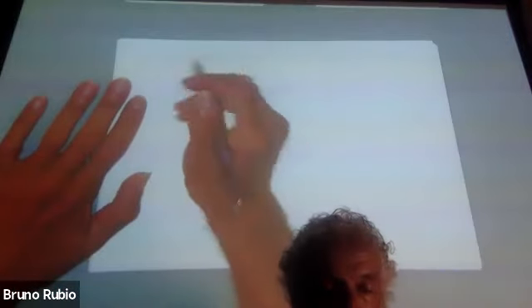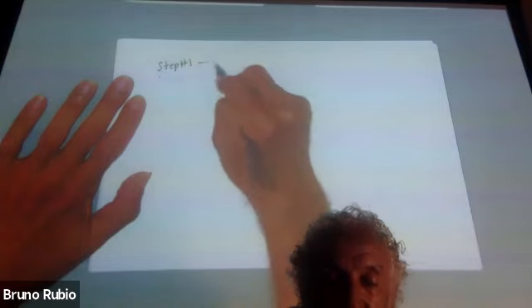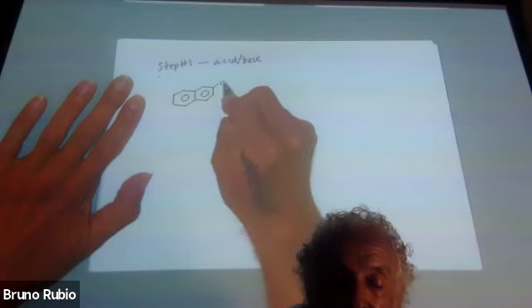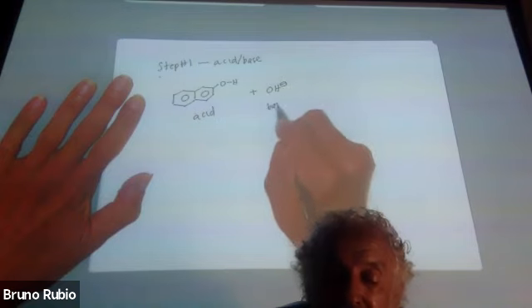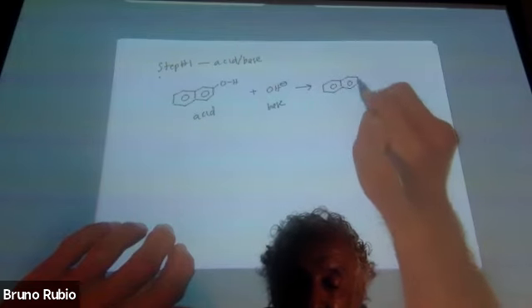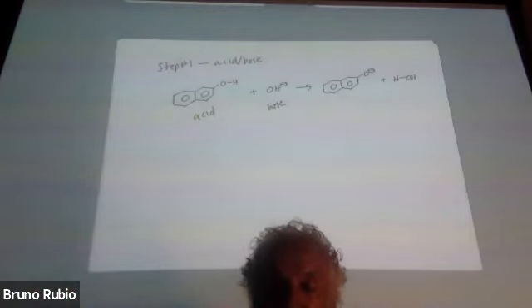So now let's talk about some of the chemistry of the experiment. First of all, step number one is an acid-base reaction, where you take the 2-naphthol and react that with, okay, this is the acid, right? And you react that with hydroxide ion. This is the base. And maybe you remember from Gen Chem that an acid is a proton donor, a base is a proton acceptor. So what is happening here is that the acid gives up that proton to the base. And so you get this naphthoxide plus what looks like water. So that's just the acid-base reaction.